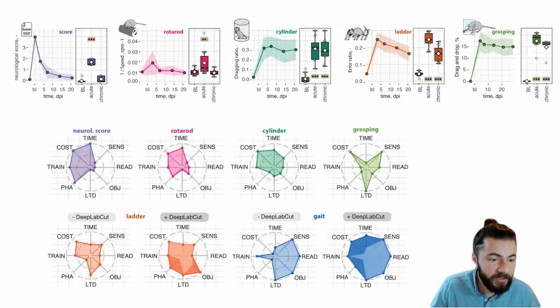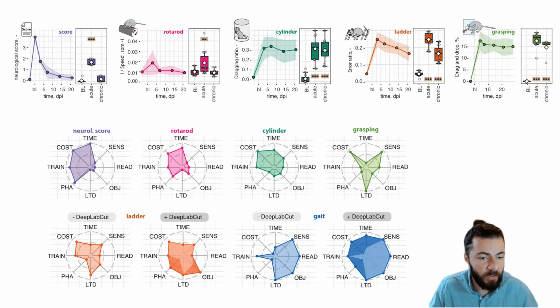As the last step, we benchmarked DLC tracking performance against popular functional tests to detect stroke-related functional deficits. And in summary, we can say that only the most sensitive conventional tests were able at all to detect long-term impairments after strokes. But these tests were often very tedious and still provided very few readouts, whereas DLC-assisted tracking that we present here provided many biological parameters. The setup reduced analysis time while minimizing the observer biases during the evaluation to generate quantitative and reliable behavioral data.